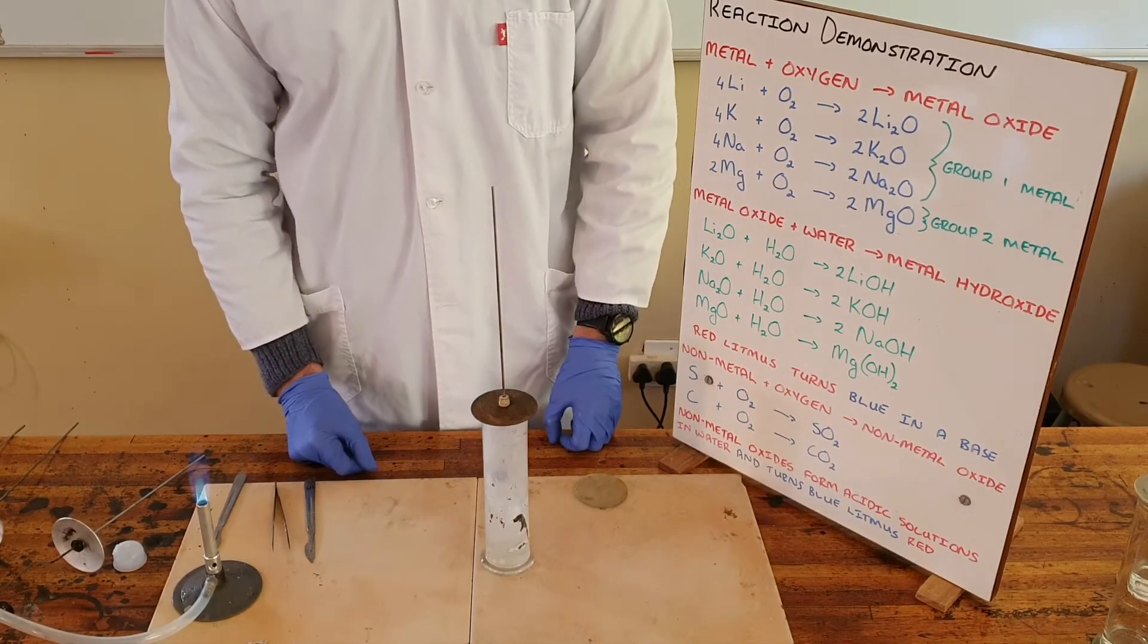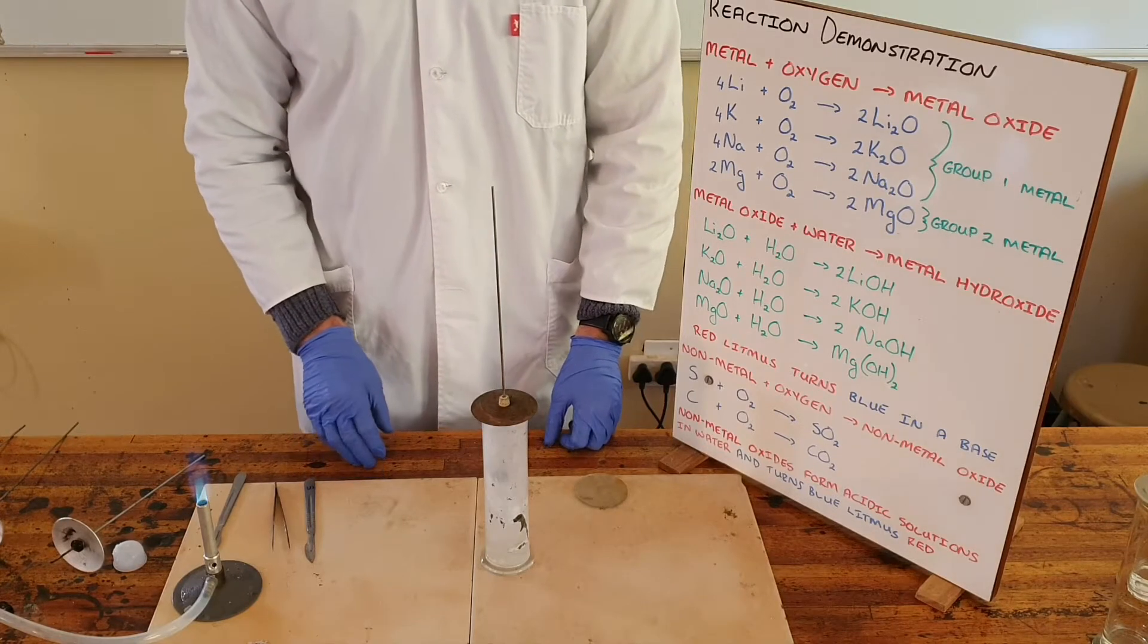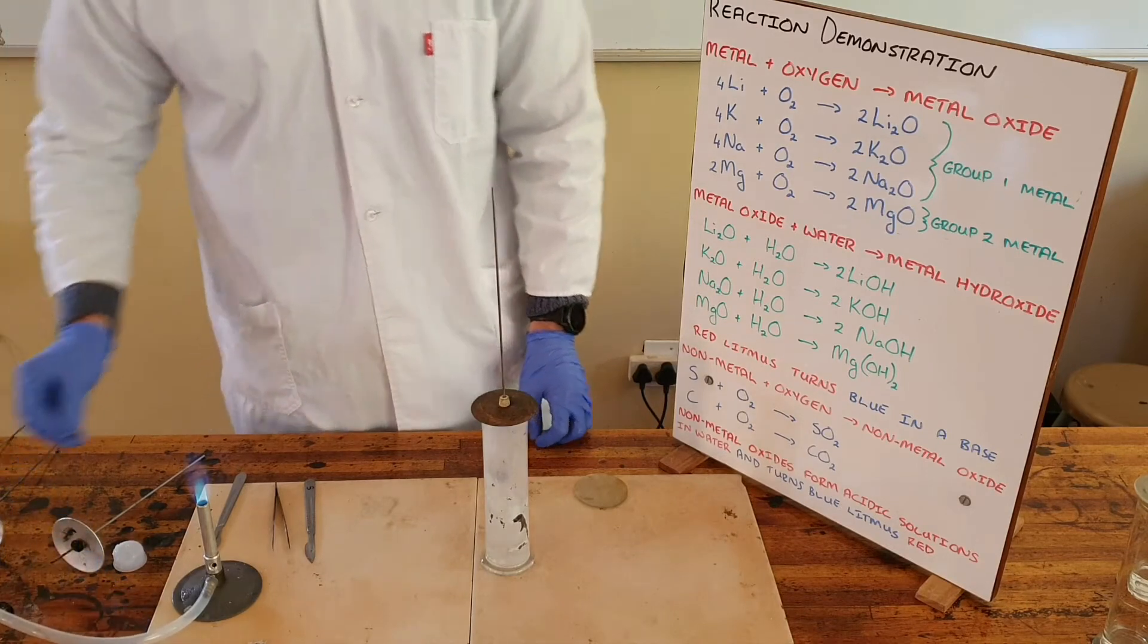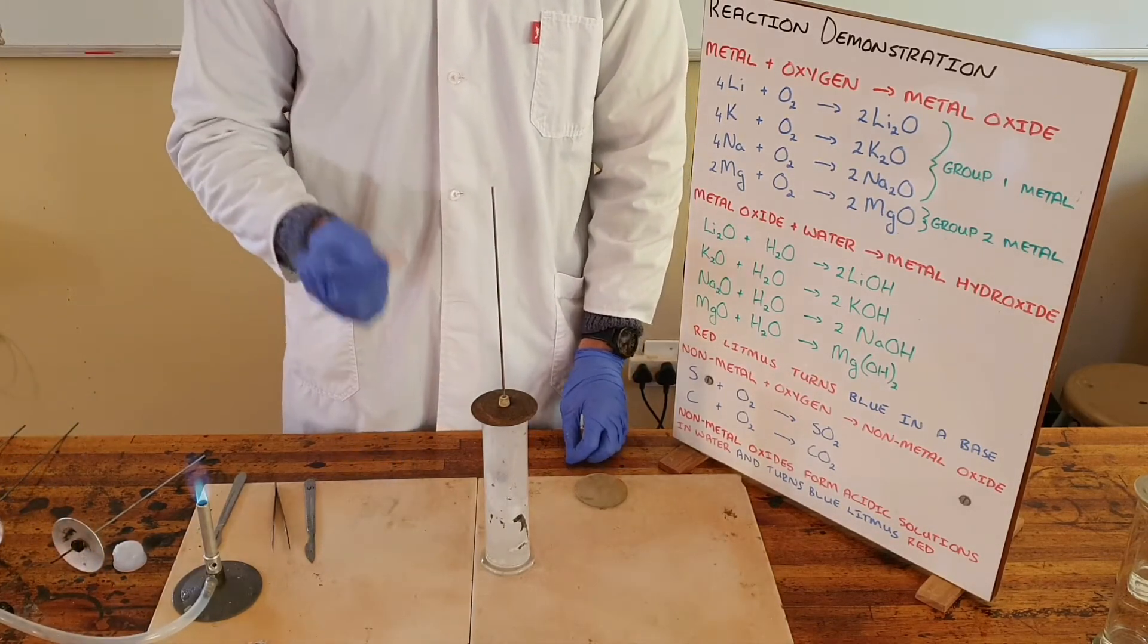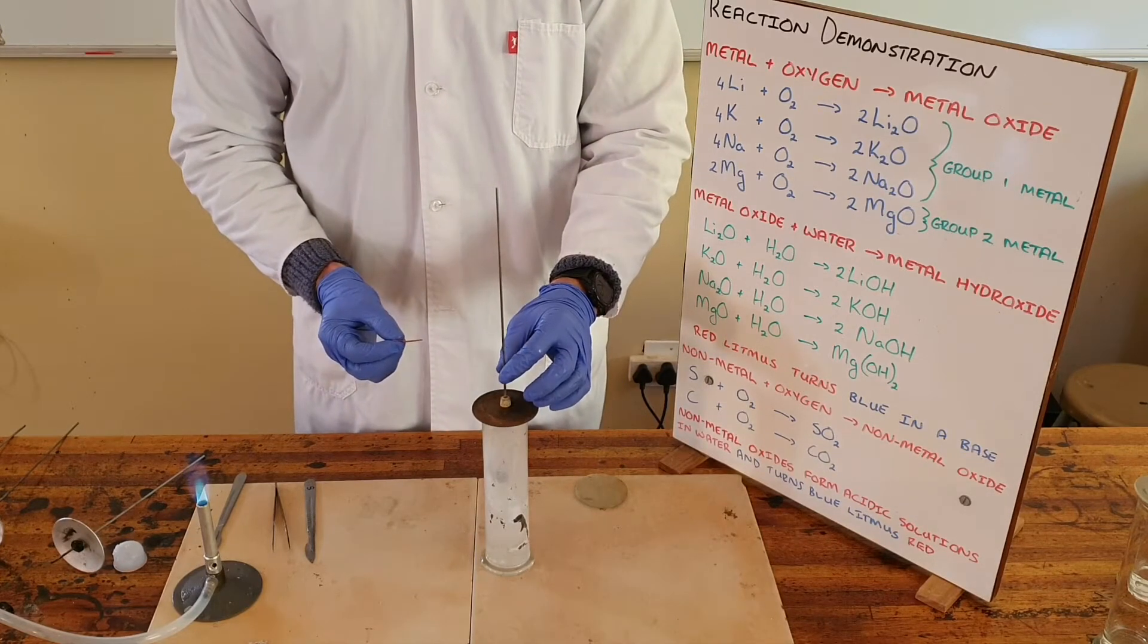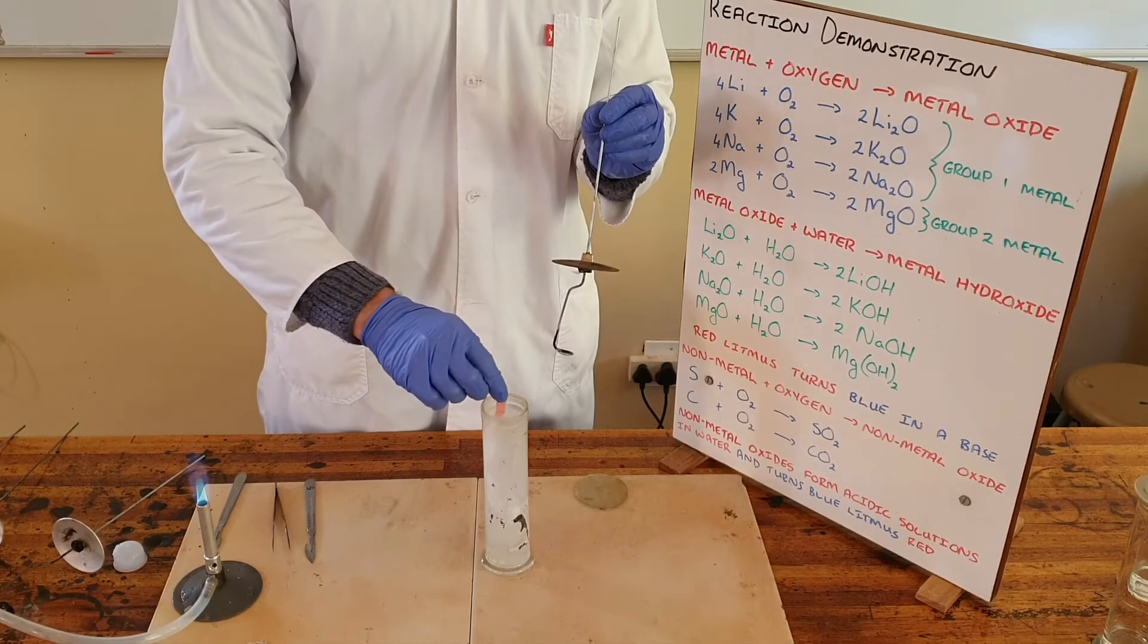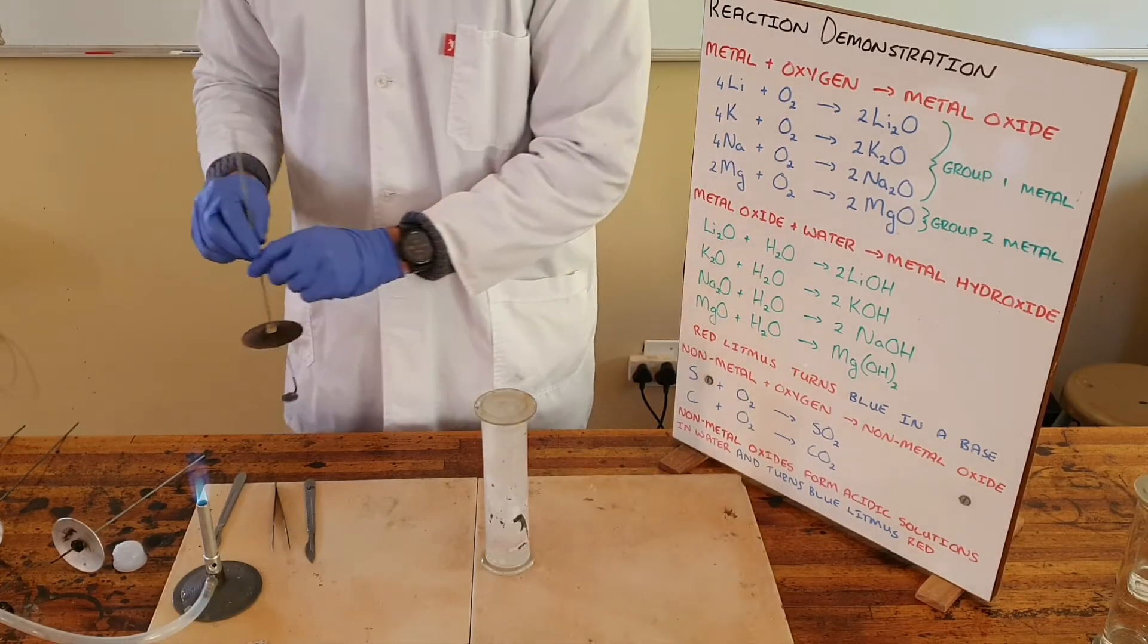We can see the white smoke and white powder forming—that is magnesium oxide. We know that a metal oxide when combined with water forms a basic solution. This can be shown by adding a piece of red litmus paper to that solution. Red litmus paper will turn blue in the presence of a base.